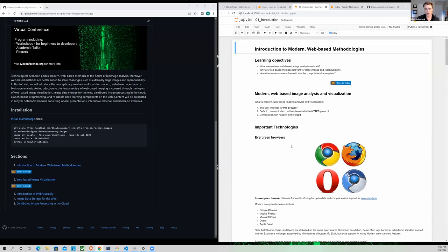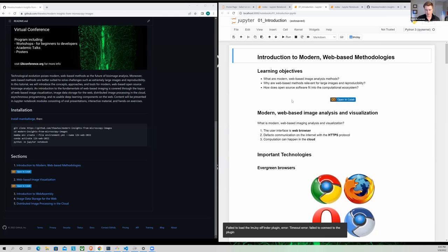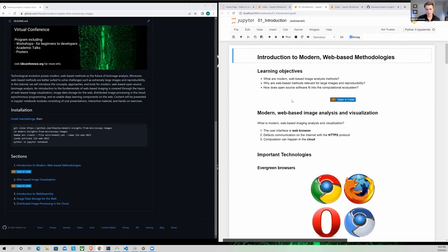We'll start off with an introduction. If you don't have the conda environment installed, you can run this notebook in Colab — the link is here. This tutorial intends to provide a background on what are the modern web-based image analysis methods, why they are relevant for large images and reproducibility, and how does open source software fit into this ecosystem.